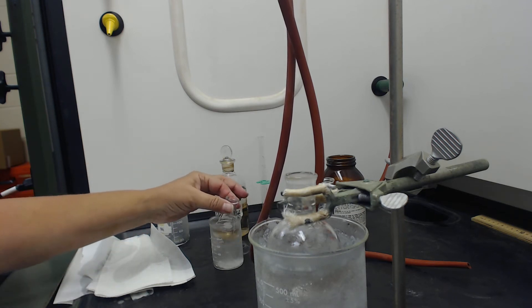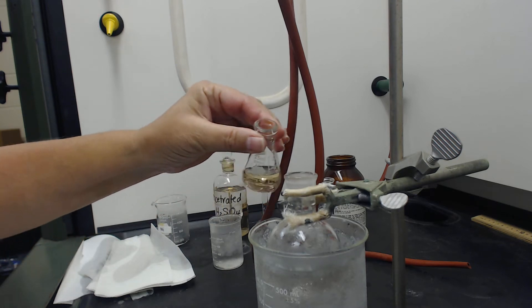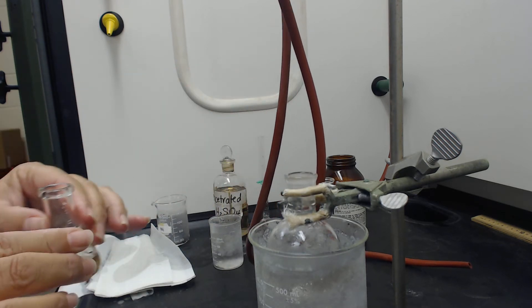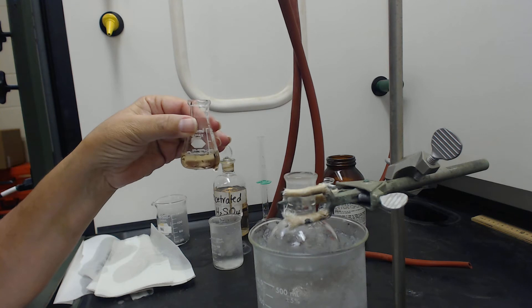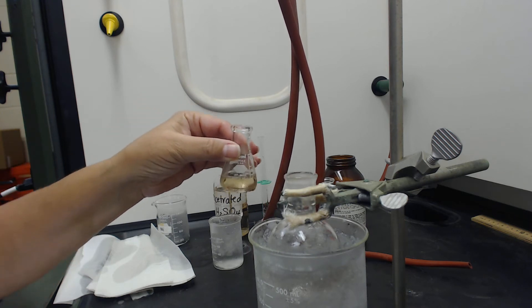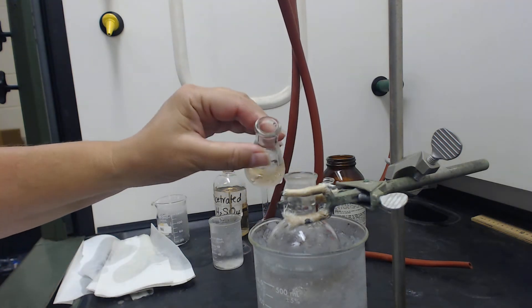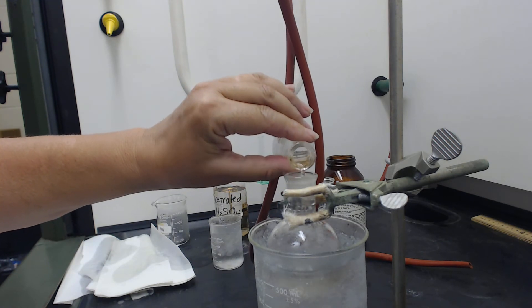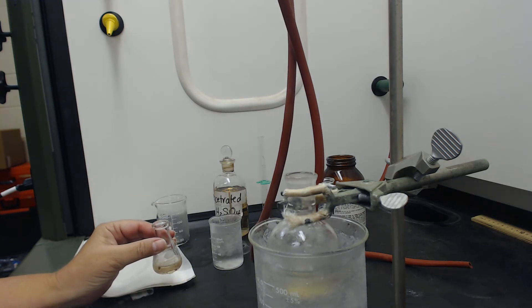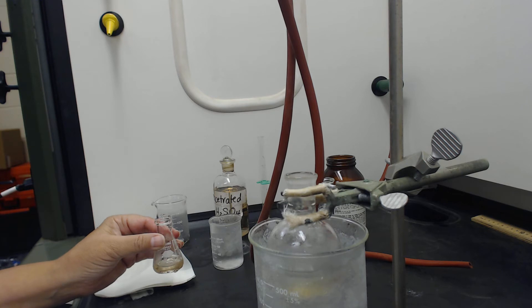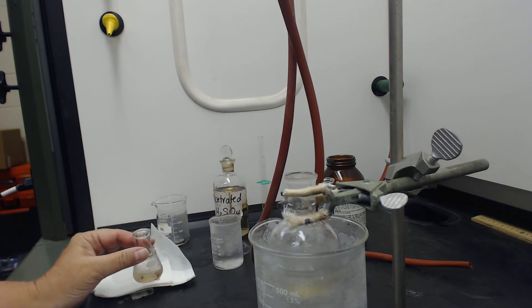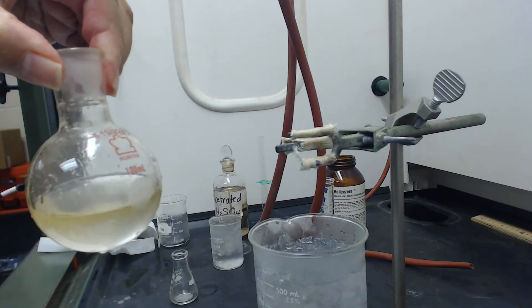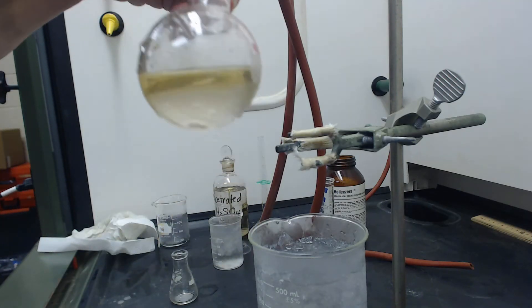Now I'm going to slowly add it to my flask over a few minutes. I'll just pour a little bit in. It's bubbling, so it's very exothermic. I'm going to continue. I'm going to pause this while I continue to do that.